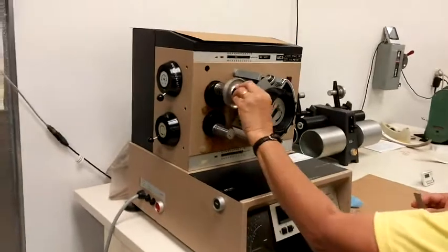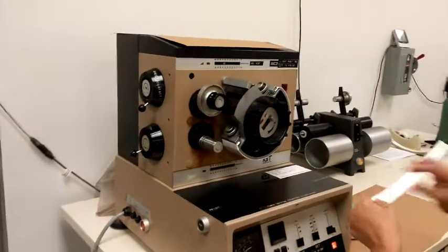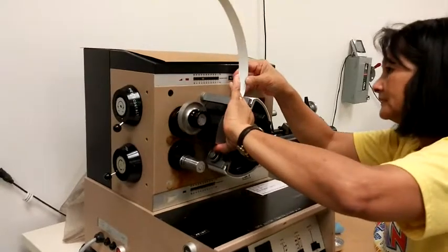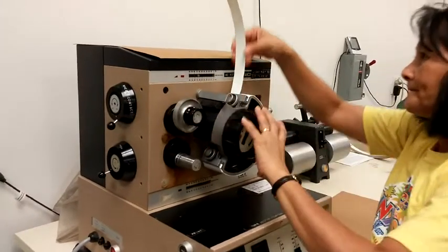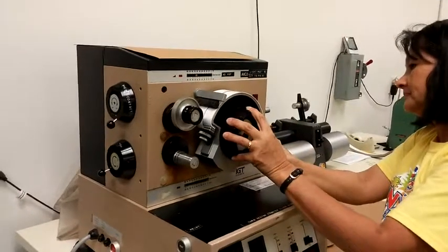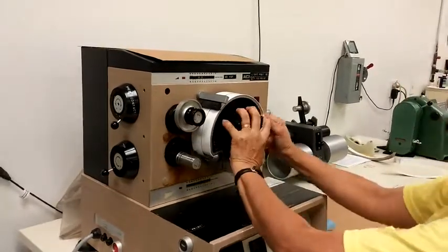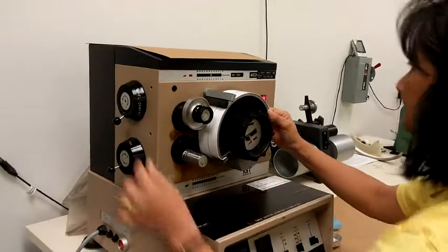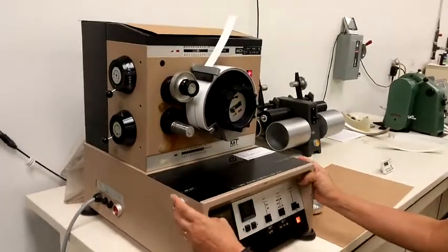The point at which the picking and blistering starts is the end point of the test. The reported units for both pick and blister are viscosity velocity product, or VVP. At a known oil viscosity, this value relates to the velocity or press speed that can be achieved before the sheet is damaged.